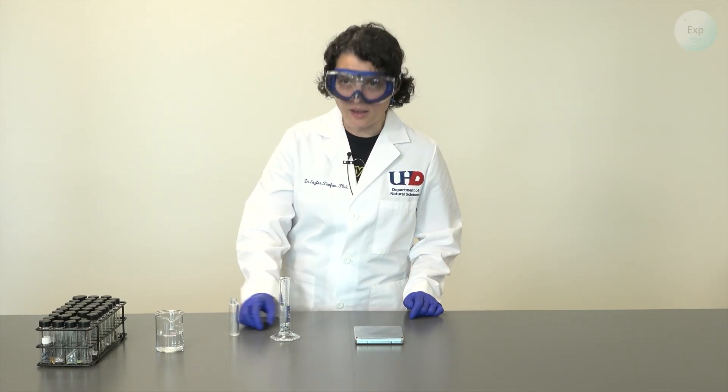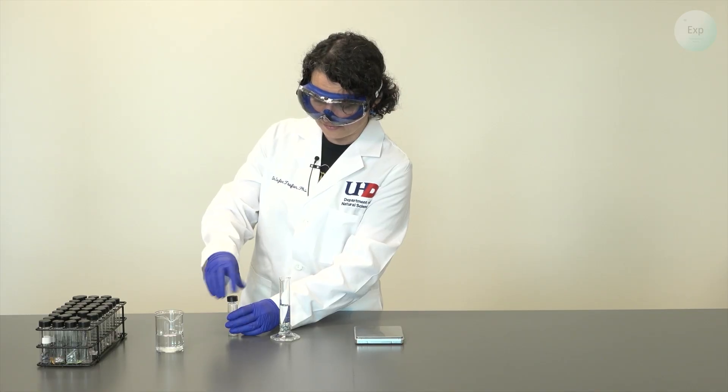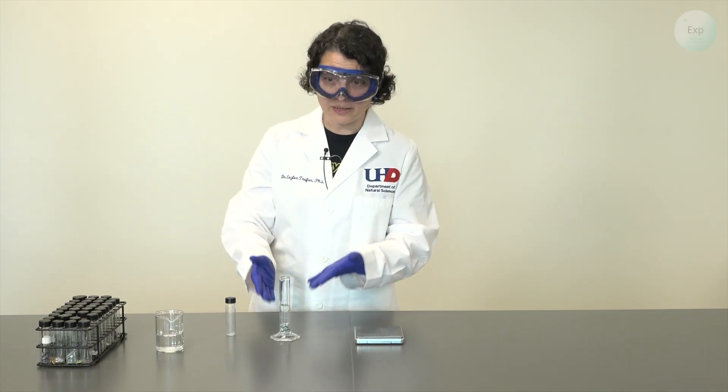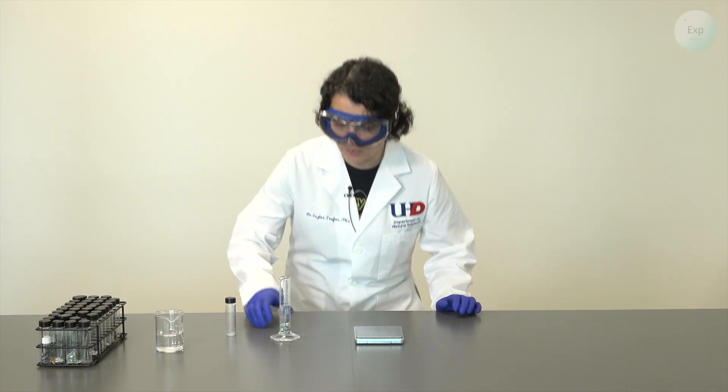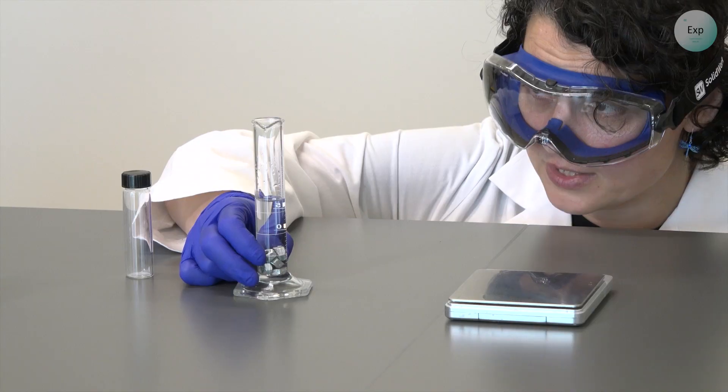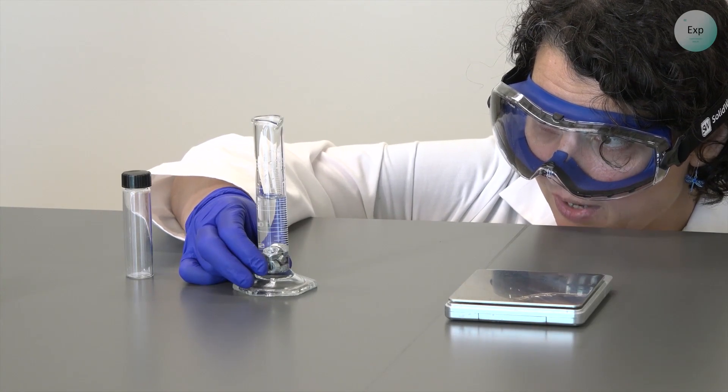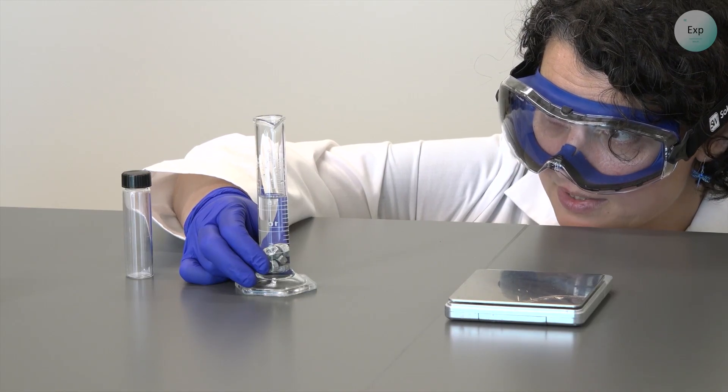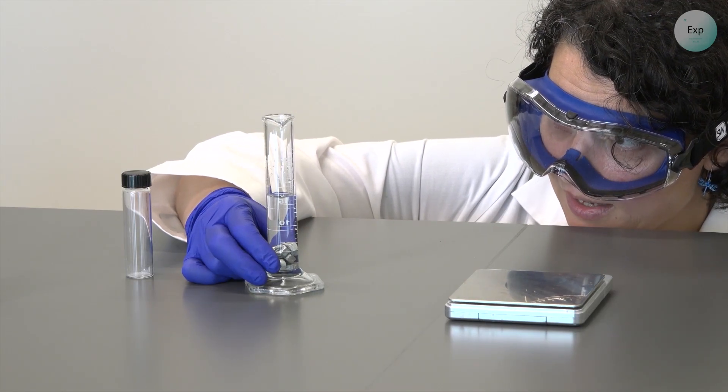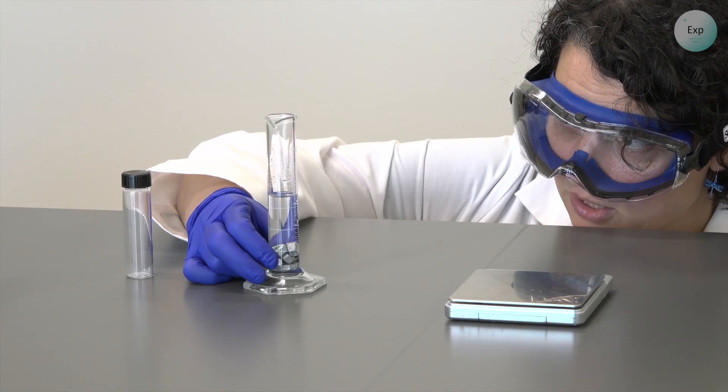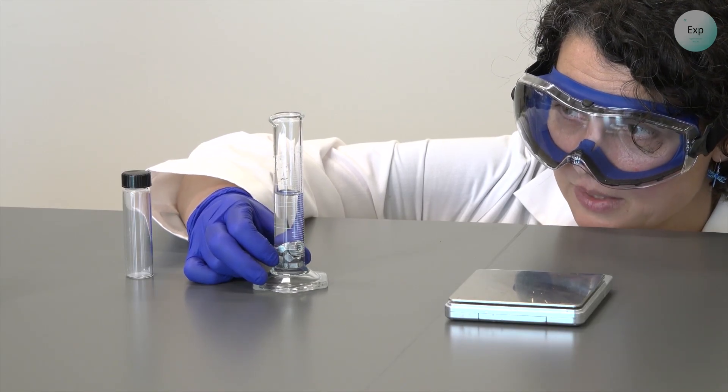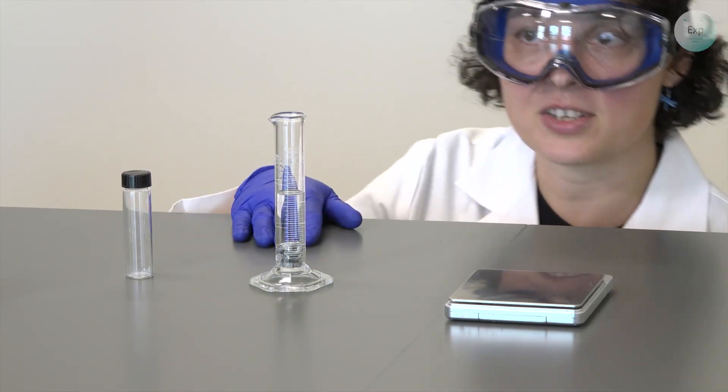Now we record the volume of our mixture. We have our metal pieces inside and then we have our water. We lower ourselves to eye level with our meniscus. We find that our volume is between 17 and 18. It seems to be close to the middle of that so we are going to say it is 17.5.